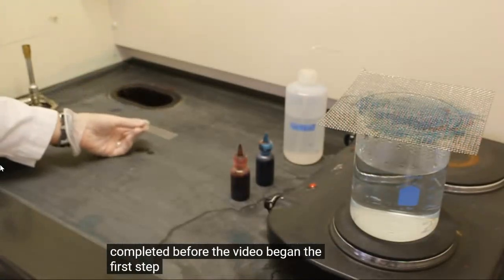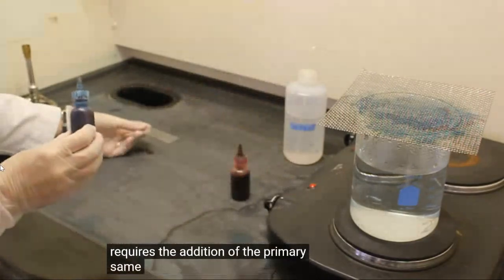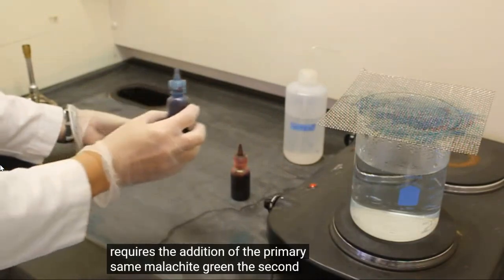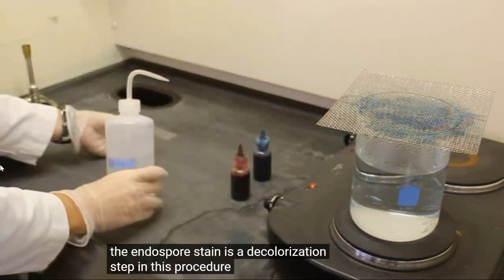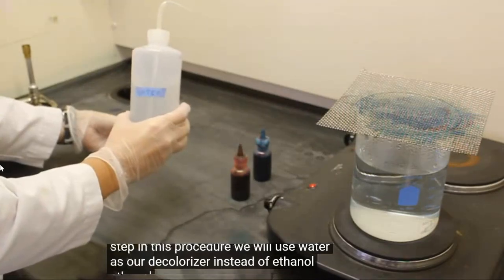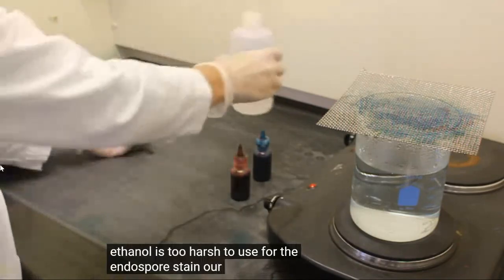The first step of the endospore stain requires the addition of the primary stain, malachite green. The second step of the endospore stain is a decolorization step. In this procedure, we will use water as our decolorizer instead of ethanol. Ethanol is too harsh to use for the endospore stain.